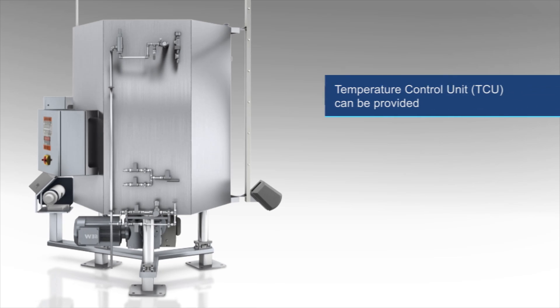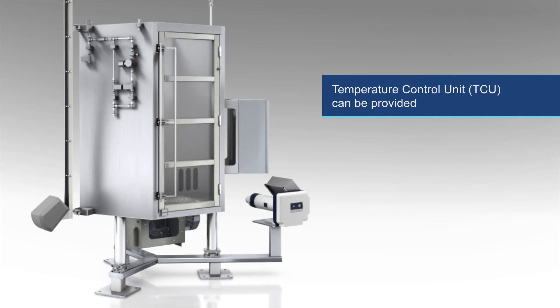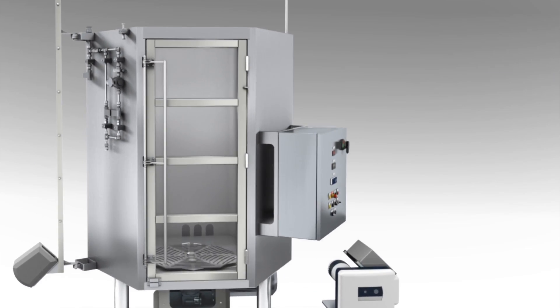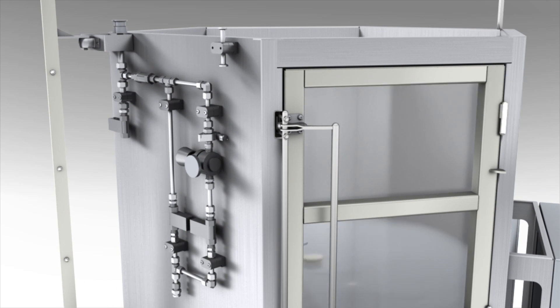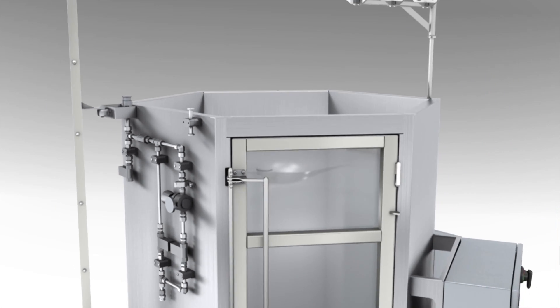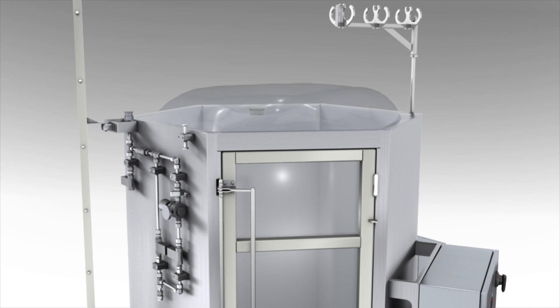A temperature control unit, or TCU, can also be provided. An inflation system to automatically inflate the mixer BPC for installation, maintain a rigid BPC during mixing process and vent as required.